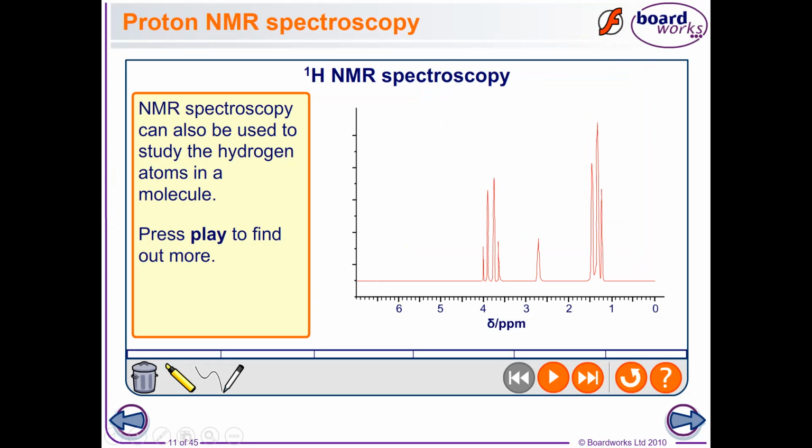Okay, guys, now having refreshed myself with a nice cup of coffee, let's dive into Proton NMR spectroscopy. First thing you will notice is in the example spectrum, it's far more complicated looking than the carbon-13. Carbon-13 had single peaks. That was pretty easy. These peaks are being split. Why is that? Well, let's have a little think about it.